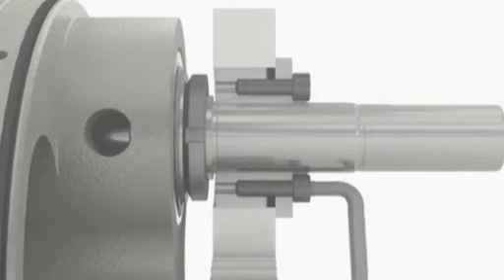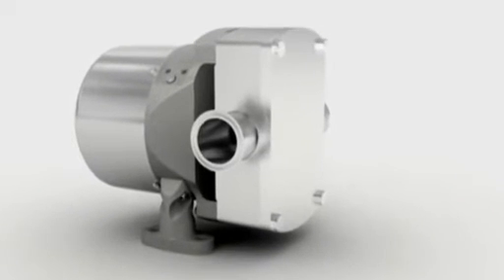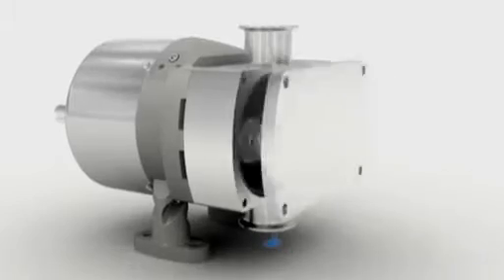And with the elimination of keyways, users can benefit from increased pump life. The Optilobe range features universal mounting, which gives you complete installation flexibility throughout the plant.